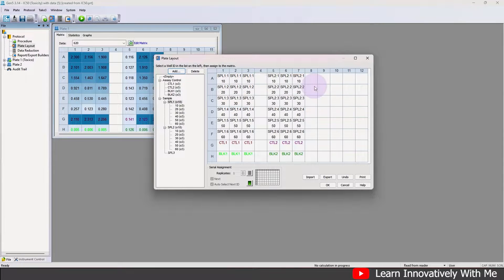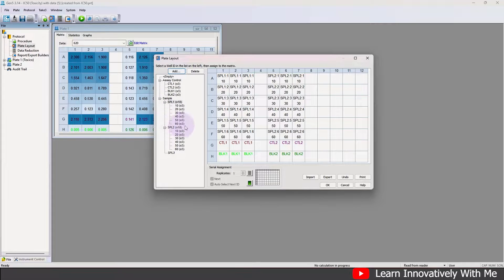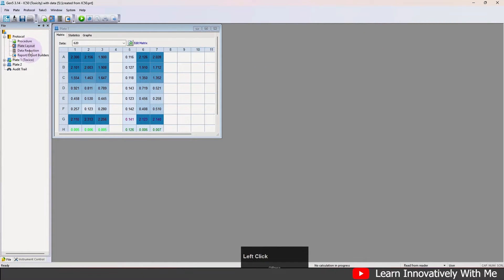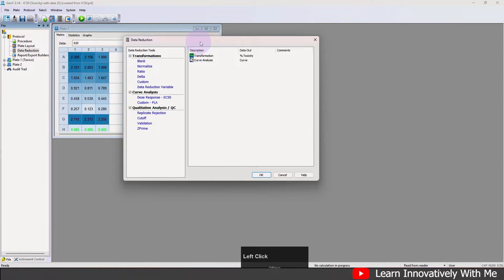Next, check the plate layout to see how they set it up. In your case the plate layout may be different — set it up for your experiment, like SC control, control one, control two, blank one, blank two, and sample one and two in different dilutions. I'm going to close this and show you from scratch how to set up when you are going to take the absorbance and perform the analysis in Gen5 software.